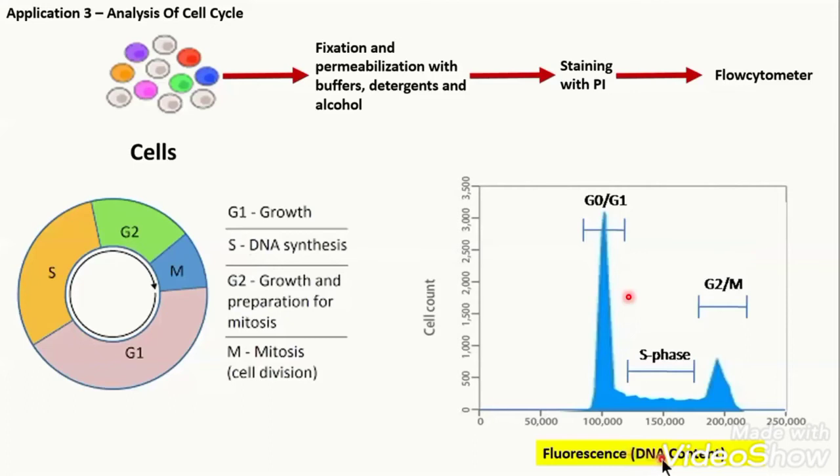Now, nowadays we are computerized and we have amazing software which can count the number. But I have heard a story that initially with the flow cytometer, there was no counting software, or the software was not able to count the percentage and the number, but it gave printouts like this.